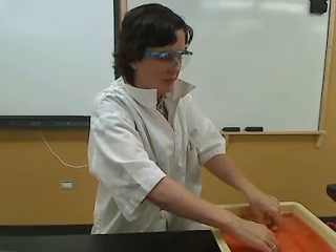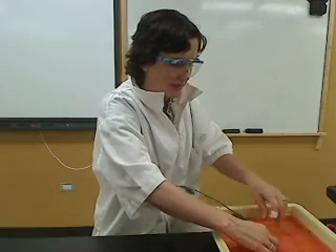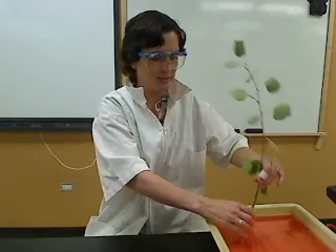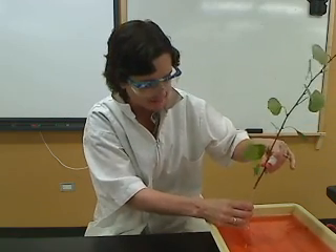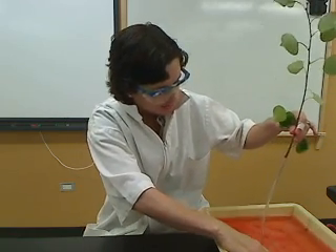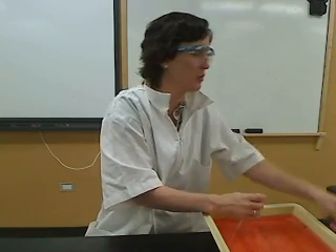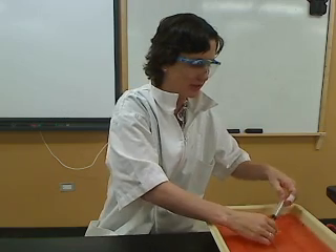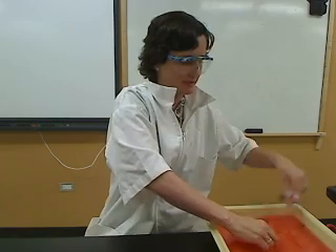Once the stem is underwater, position it inside the tubing. I can lift this up so you can see it's in there. You really have to play with this. If you notice, the water's coming out — that was a problem. So what I'm going to have to do is take this out and run the water through it again, because we don't want any air bubbles in here. Draw the water back through, hold it down, and cut a fresh tip.